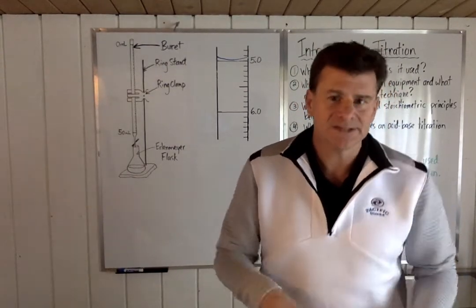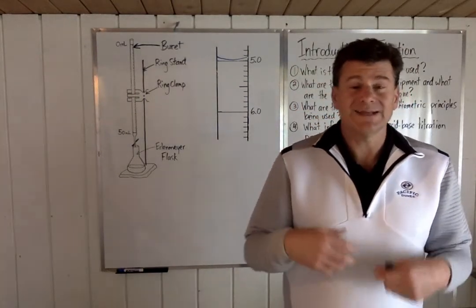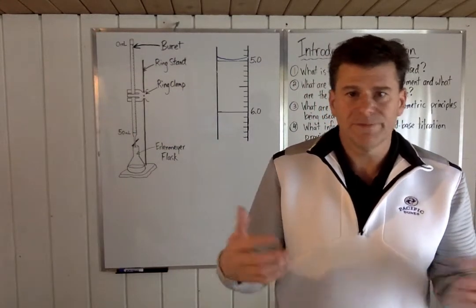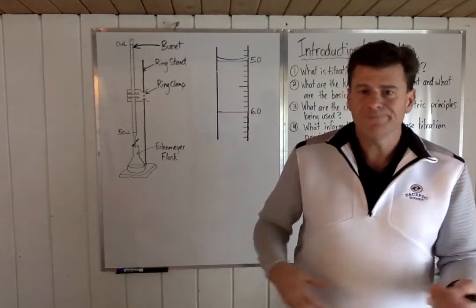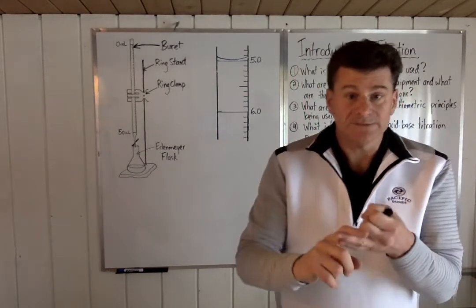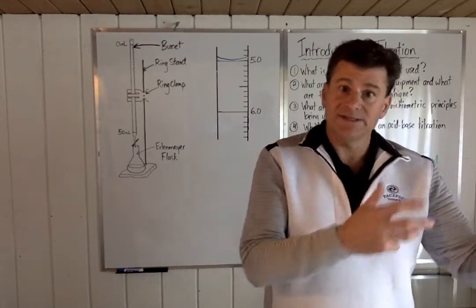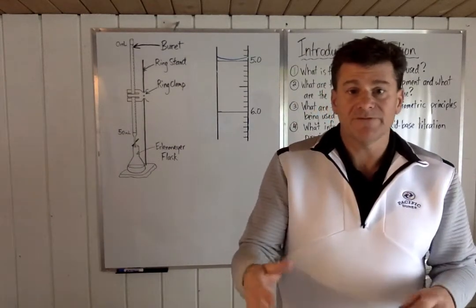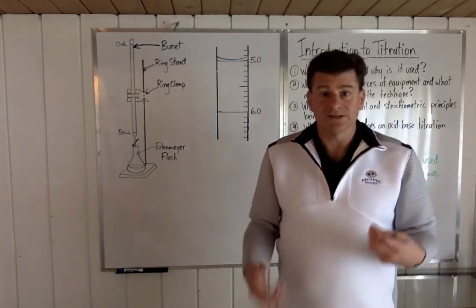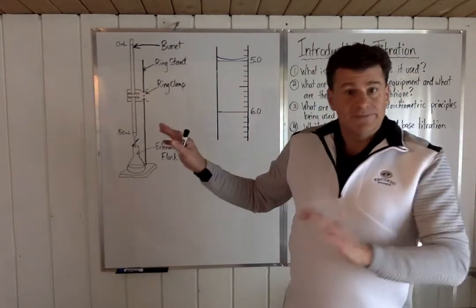What you don't know, perhaps, is the concentration of the HCl. Perhaps you don't know the identity of the diprotic acid. So there are certain unknown things about your solution down there. Oftentimes it's the concentration of it, and sometimes it's even the actual identity of it. And you'll see that titration, as we get more detailed into this, will give you enough information to go back and use your skills from the acid-base unit and hydrolysis to identify what this thing is, okay? Now, that's the basic setup.